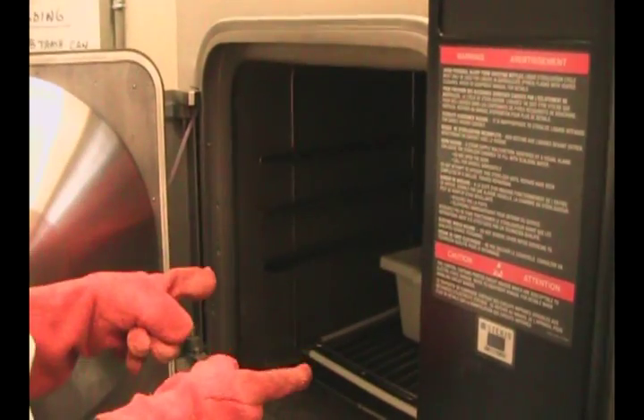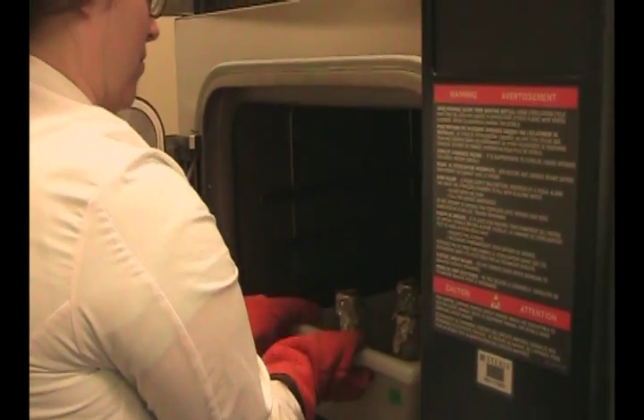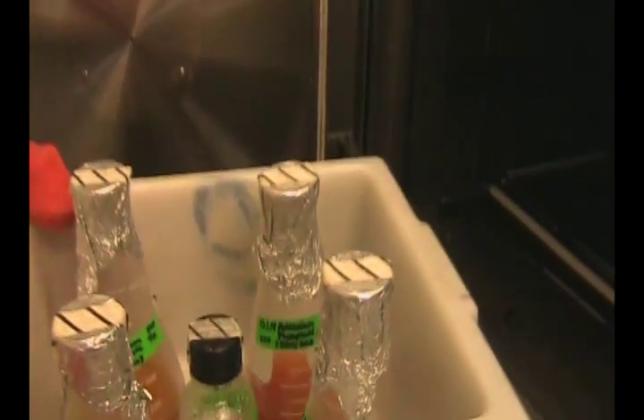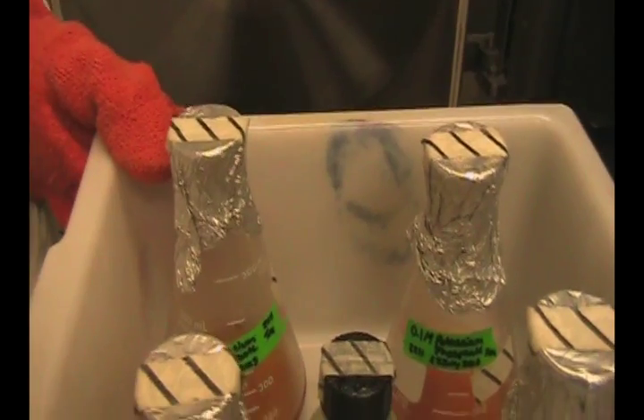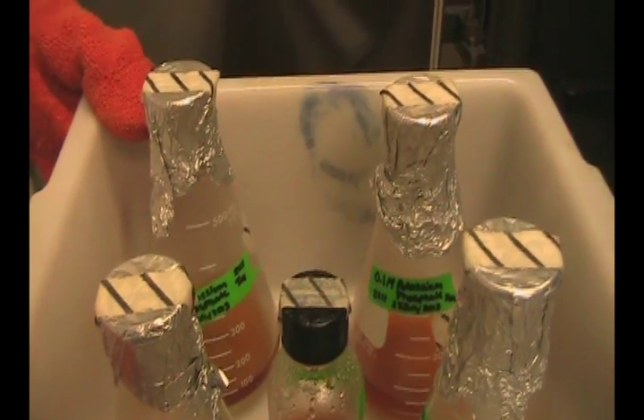Be very careful — the door is ultra-hot and the inner chamber is ultra-hot. Remove your samples. You'll notice that your autoclave indicator tape has now changed from white stripes to black stripes, indicating that your contents are in fact sterile.